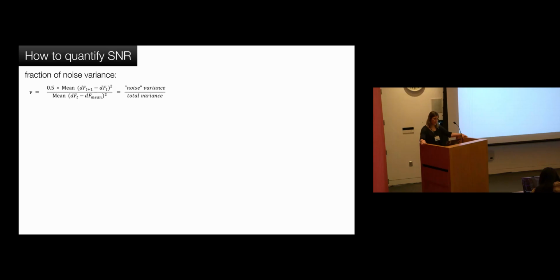That would be our recommendation generally. The last thing I was going to mention was quantifying SNR for the traces you're looking at. I think Ben was saying there's potentially another way to do it as well. One way that we do it, which is similar to Peter Rupprecht's approach in the Cascade paper, for those of you who are familiar with it, is to compute the noise variance of the cells that we record. DF here means our fluorescence trace, just additive baseline corrected.